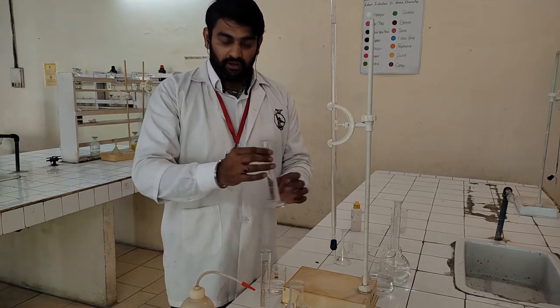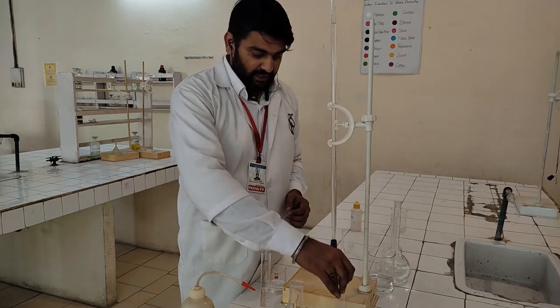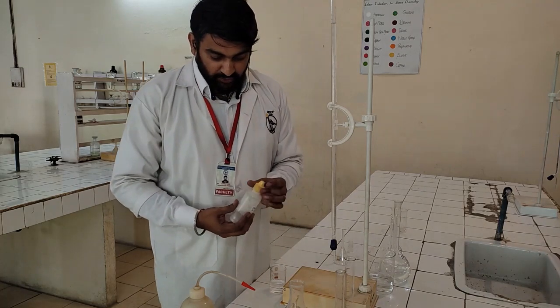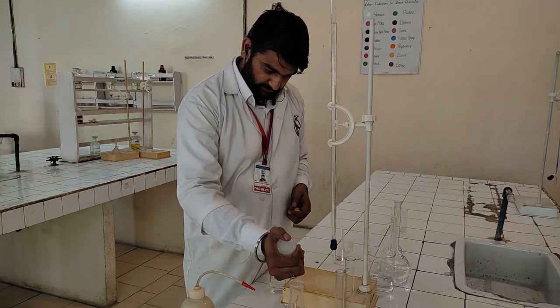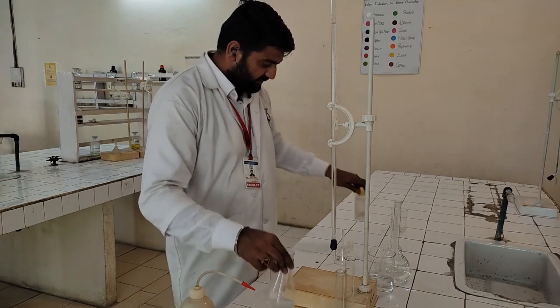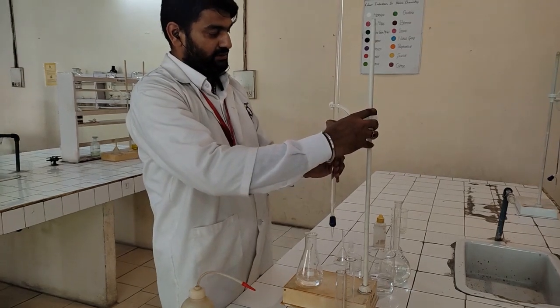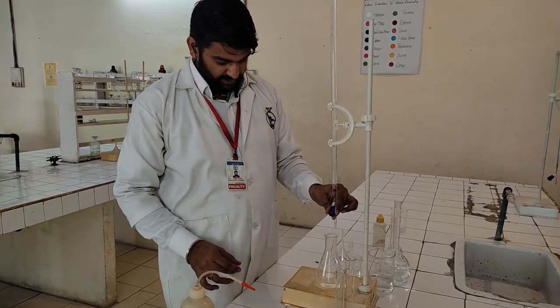Take 25 ml of the vinegar solution in a clean flask. Add 25 ml of distilled water to it. Add a few drops of phenolphthalein indicator. Mix it well. Now adjust the burette accordingly and start the assay by adding it dropwise.